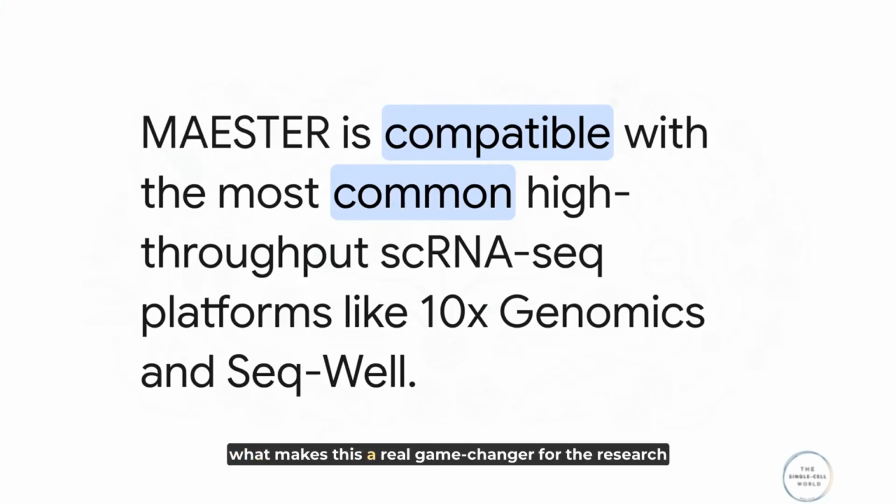Now, what makes this a real game changer for the research community is just how accessible it is. MAESTER isn't some niche technique that requires crazy new equipment. It's designed to work with the platforms that tons of labs are already using every day, like 10x Genomics, seqWell, and DropSeq. This means it can be adopted pretty much anywhere.